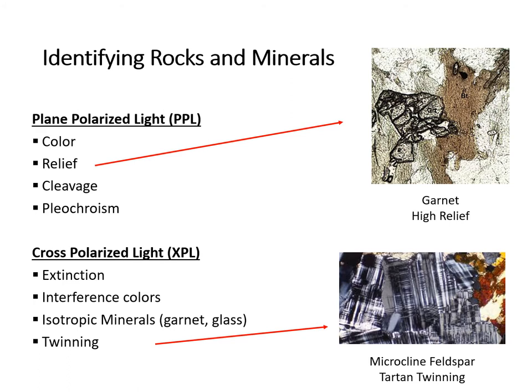There are a few ways to identify rocks and minerals in thin section, and they are different for plain polarized light and cross polarized light. For example, in the upper image, you can see a garnet that looks like it is sitting on top of the other minerals. This is because garnet has very high relief, which helps analysts to identify it. In the lower image, you can see an example of twinning in cross polarized light called tartan twinning, because it resembles Scottish pattern cloth.